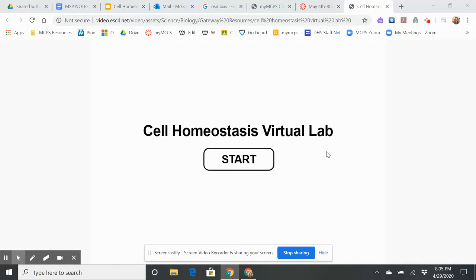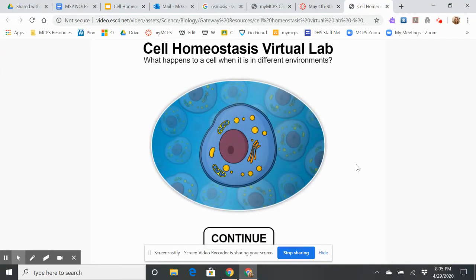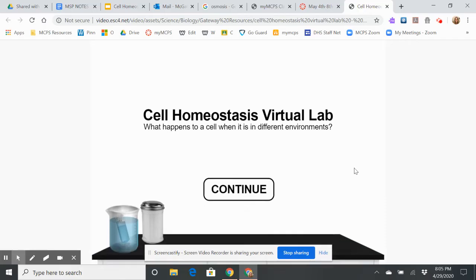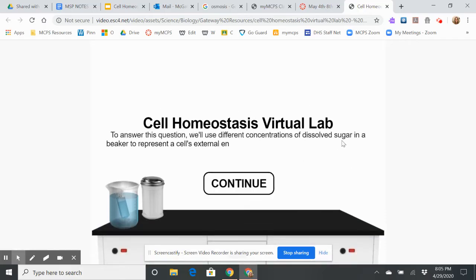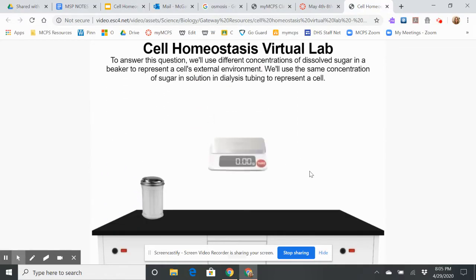Here I'm going to start the cell homeostasis virtual lab. In this lab, we're going to look at how a cell changes when it's in different environments. We're going to look at different concentrations of dissolved sugar in a beaker to represent the cell's external environment, and then use the same concentration of sugar in tubing that's going to represent the cell.